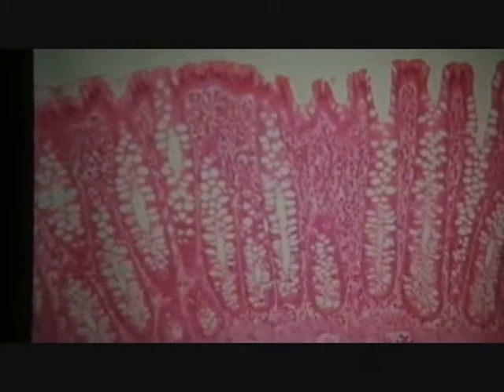New slide, same tissue. What compartment of the GI tract is this a histological section of? And for next week, getting organized is half the battle. You're first thinking, okay, what compartments should I know?